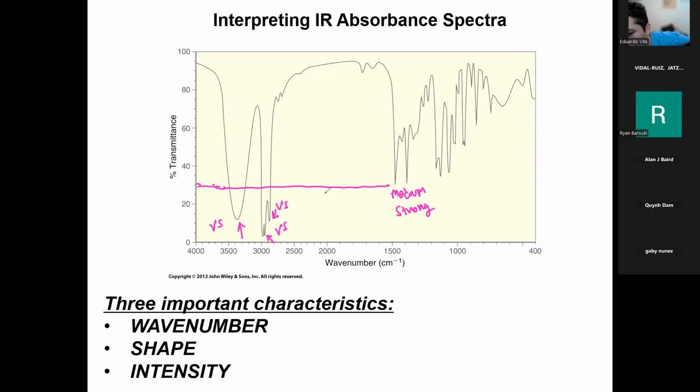Coriander is cilantro, and chickpeas are garbanzos. It's all the same thing as long as you get the gist of it. If you called the peak at 1500 weak, that's just wrong. You cannot possibly look at this, see that it is below 50, and call it weak. No, this is a strong peak. Look how low to the ground it is.